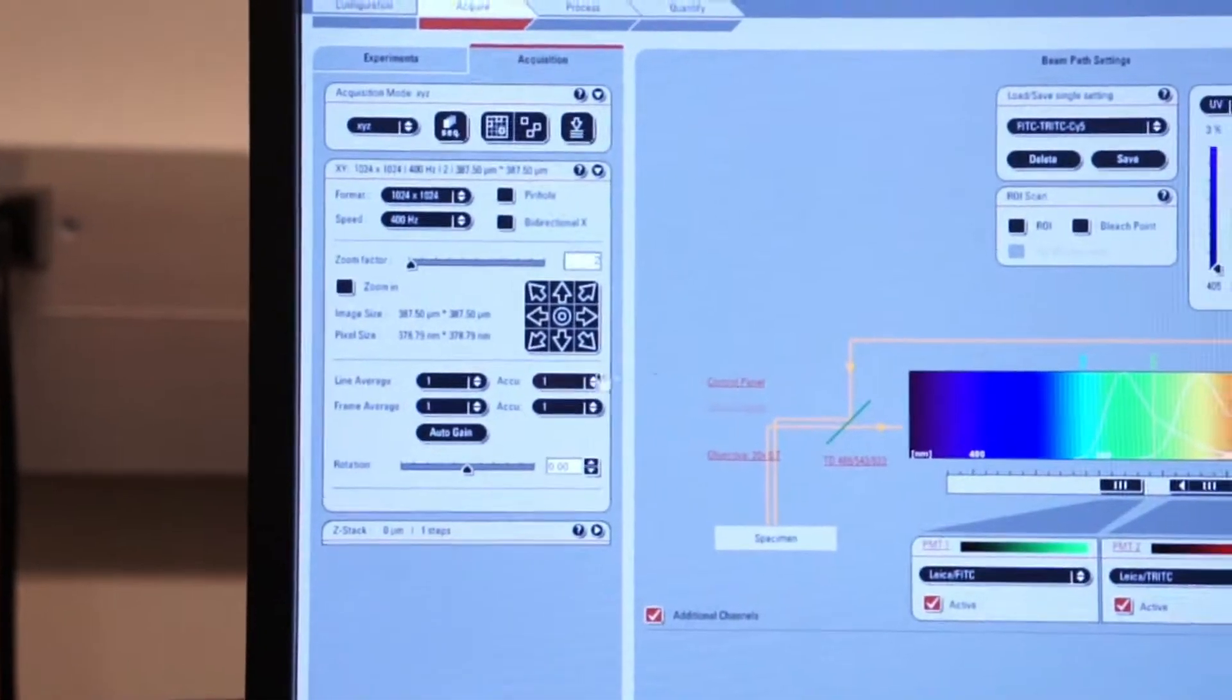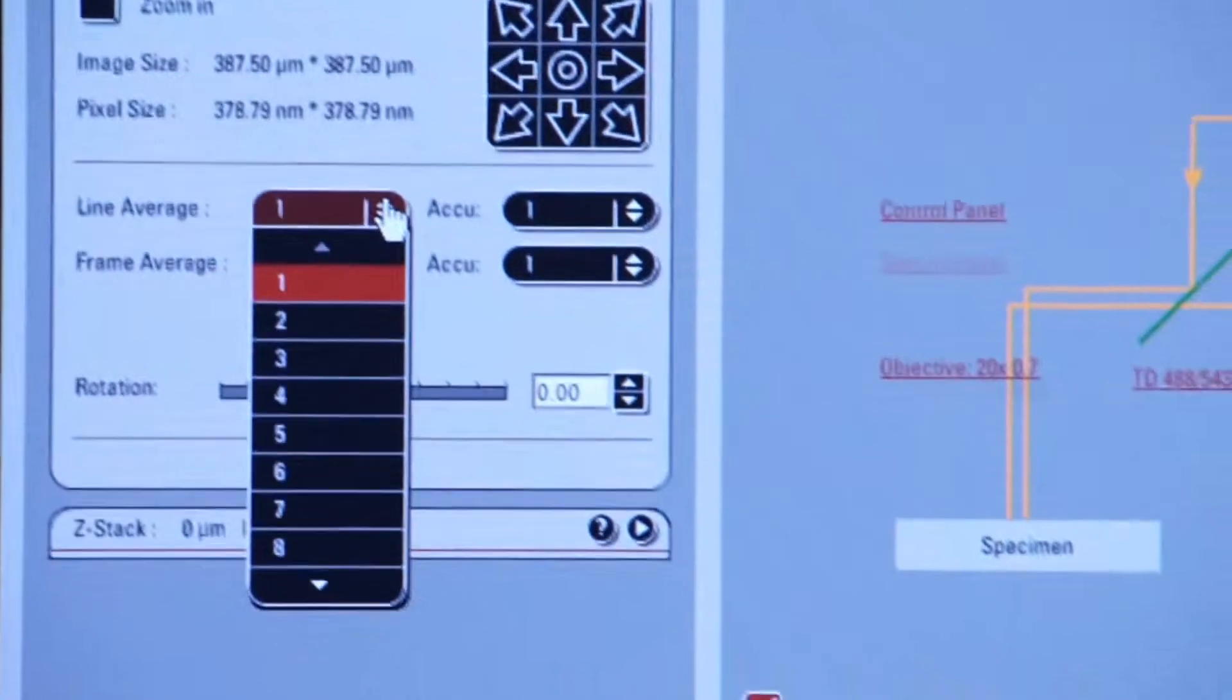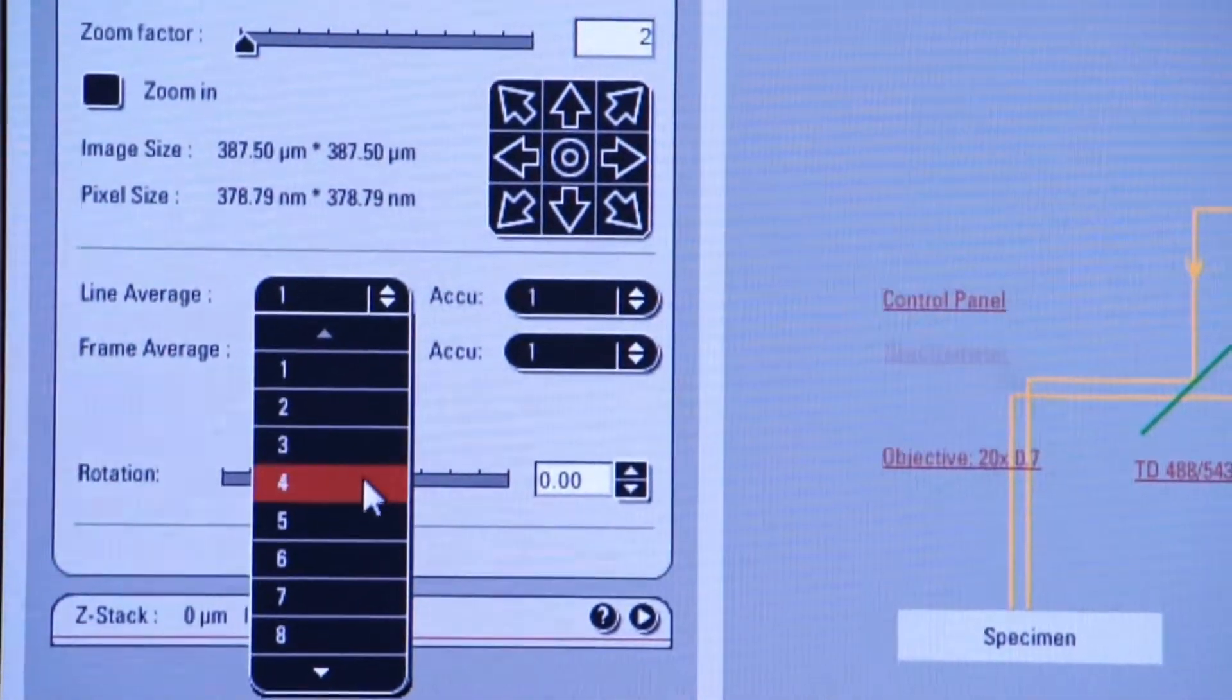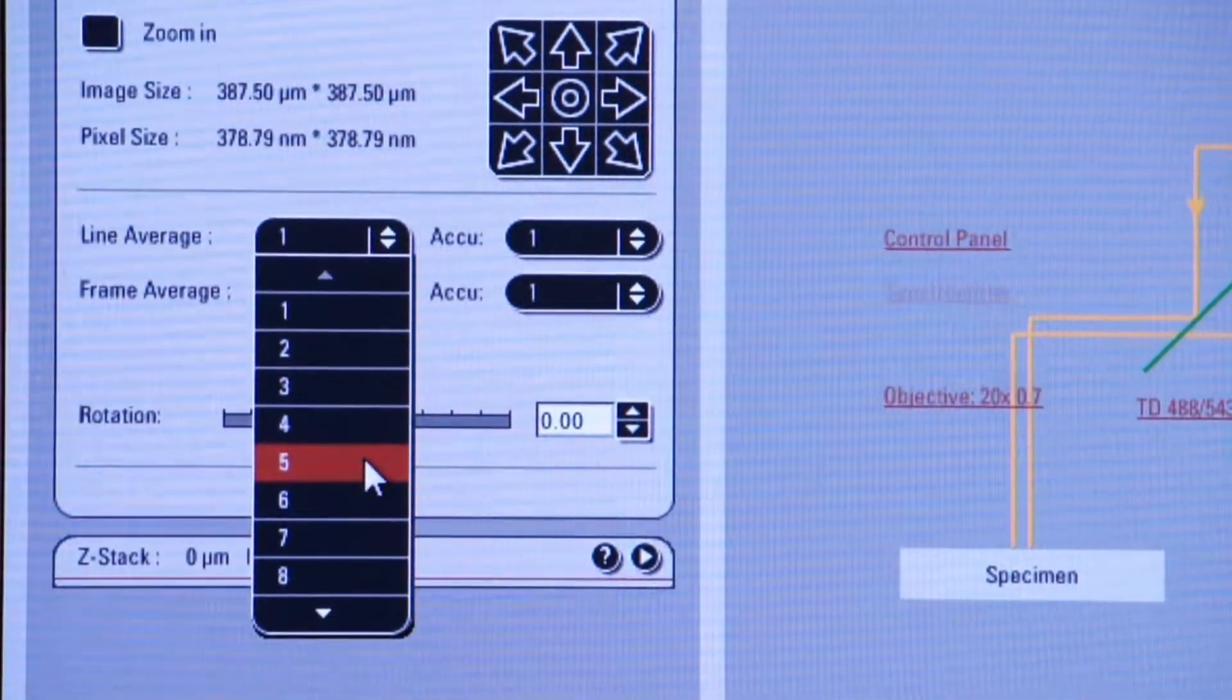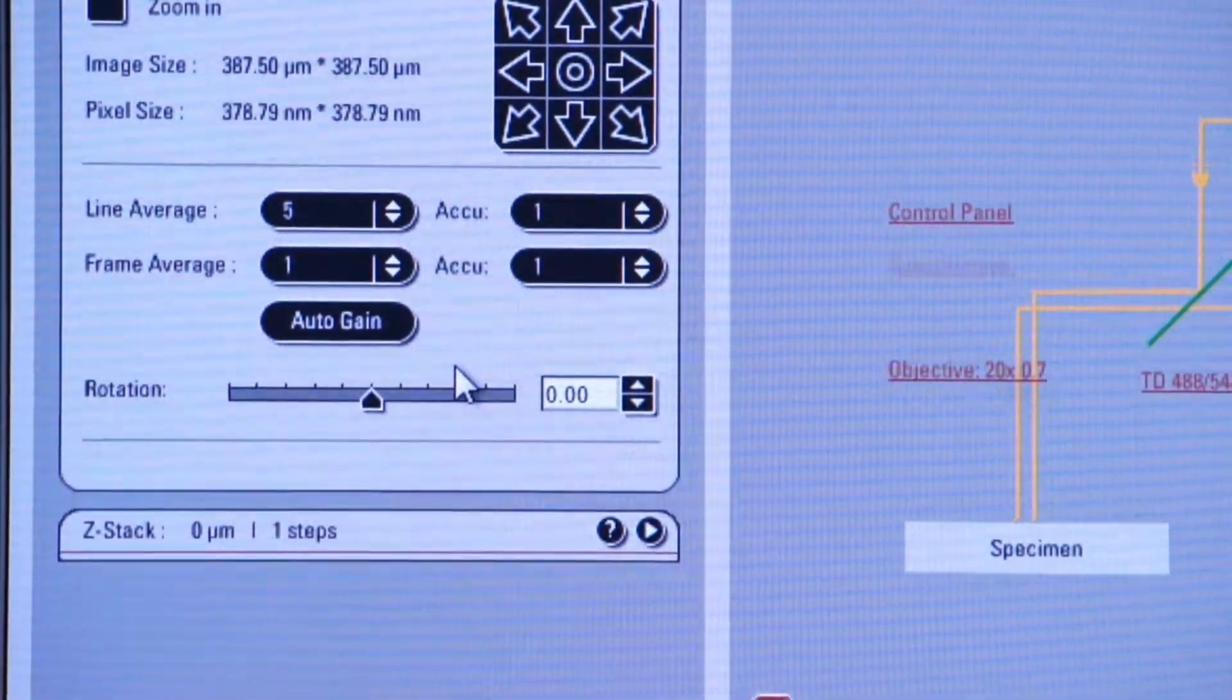If we go back over to the other screen, now we can implement line average and here we're going to average out the information from five different line scans.